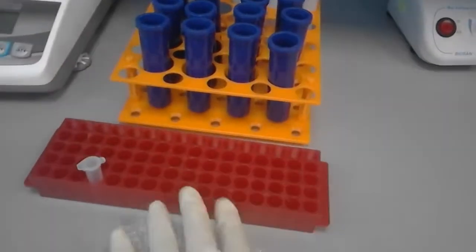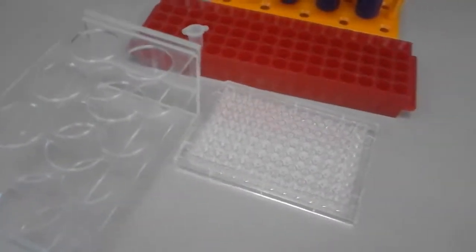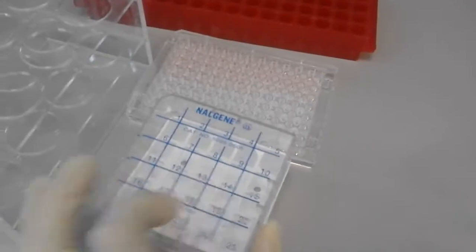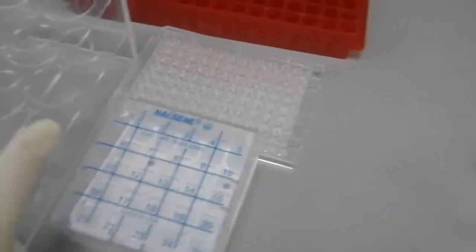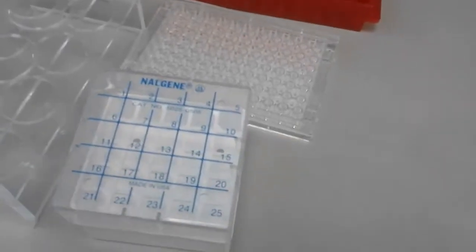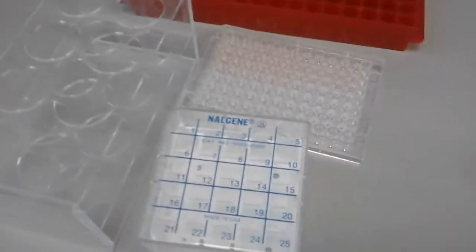Those are test tubes, eppendorfs, even smaller eppendorfs. The test tube rack with numbers, or let's say eppendorf racks.